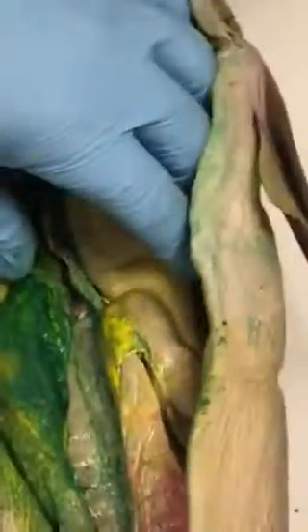Do they have greater omentum? Yes. Is this whole sac right here the greater omentum? No, this up here is the cardinal sinus. So what is the greater omentum? It's just connective tissue that's holding the intestines together, just to keep it from flopping around. Okay, got it.